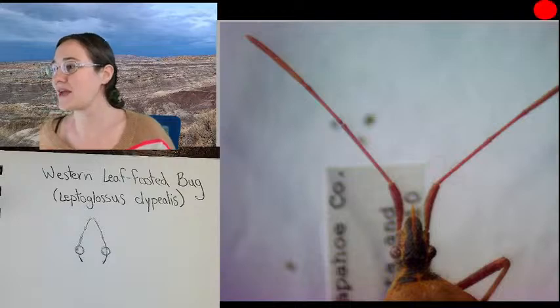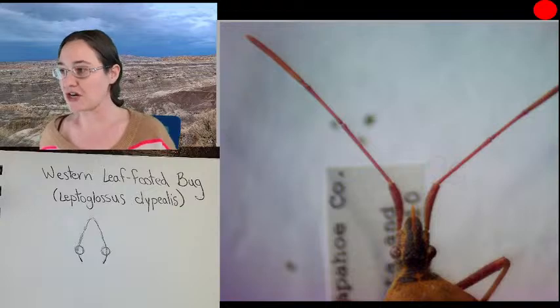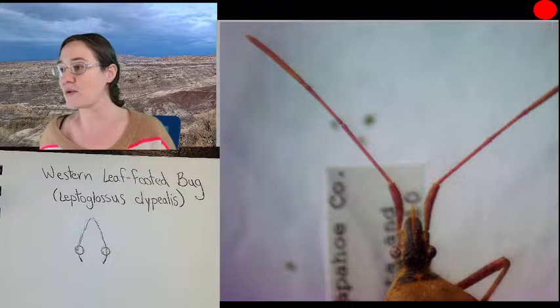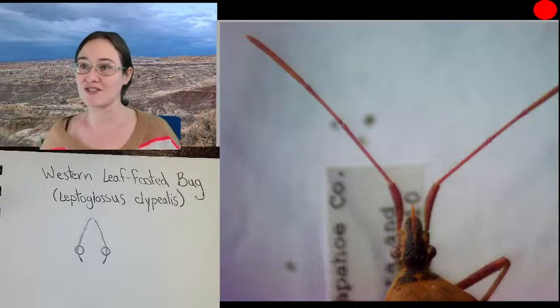Yes, Marley, we are working with a hemipteran. Hemipterans are the true bugs, right? And then other than that, we are working with a coreidae, which is a leaf-footed bug. And if you want to get even more particular, this is the western leaf-footed bug.